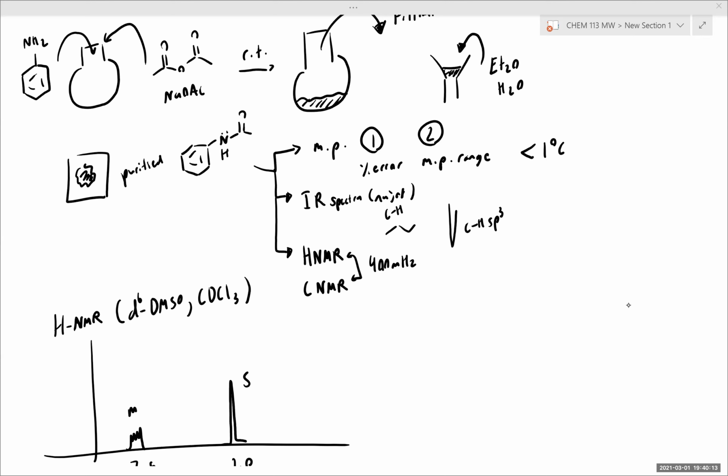Yes. You should include in your reagents and hazards table the major reagents used for each test. In terms of the spectra that you would need for your final report, you just want the IR and NMR of the product and the reactant aniline. That's all I want for this lab. So you don't have to worry about a giant spectra list, just the reactant aniline, the product acetanilide, and any experimental spectra that I give you on Canvas.